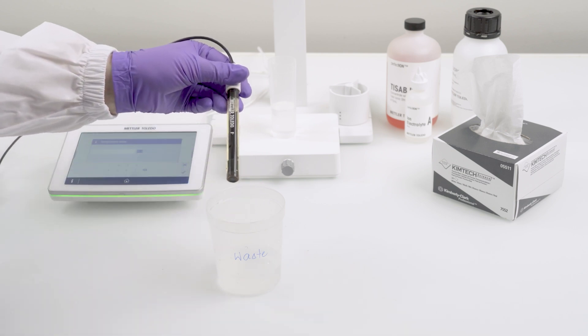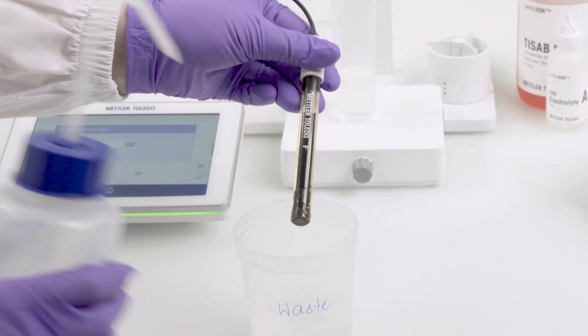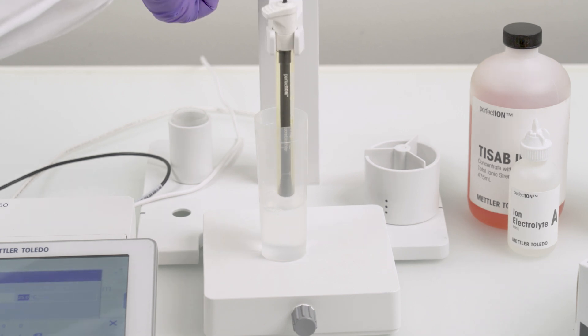For polymer membrane sensors, rinse properly with a 50% alcohol water solution. Soak the sensor in the appropriate standard overnight or for several days.